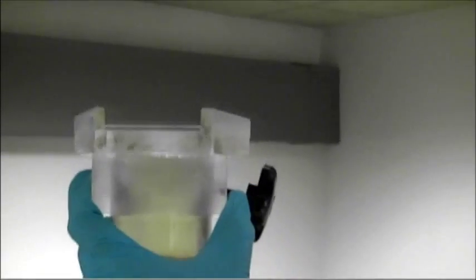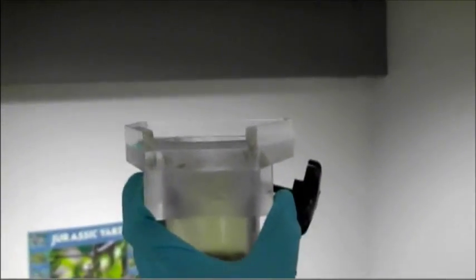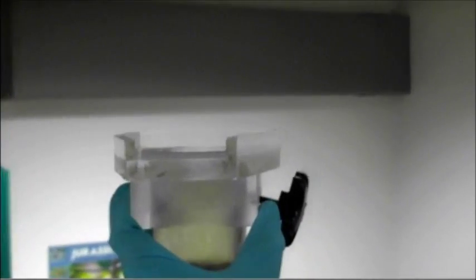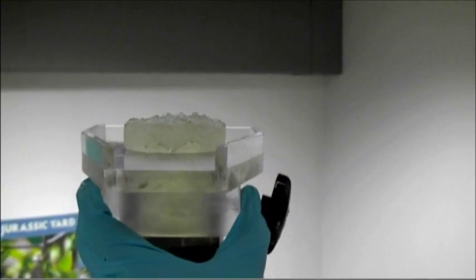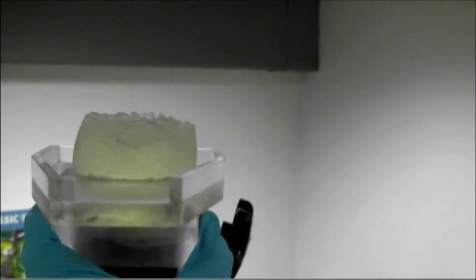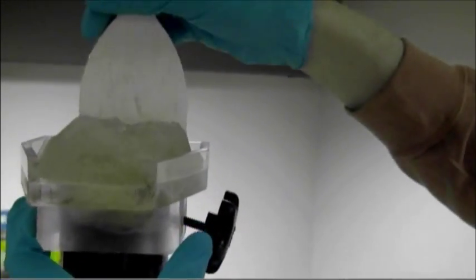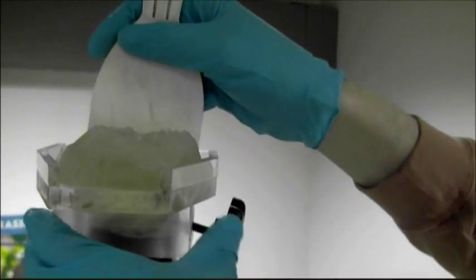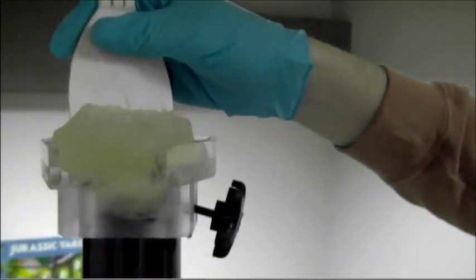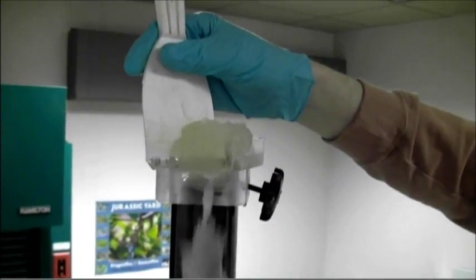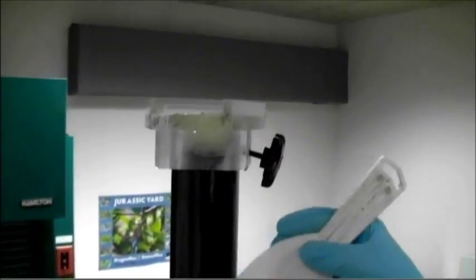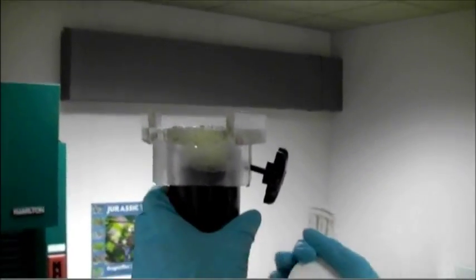All right, lower? And so you'll see the push down here, that's all the Zorbitrol stuff and we want to get rid of that. So that's basically the solidified lake water that was at that sediment water interface. We want to scrape that off and do another couple of centimeters.